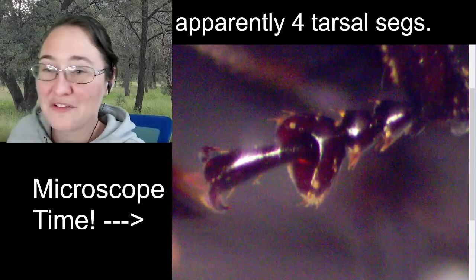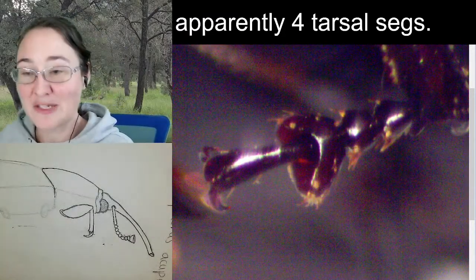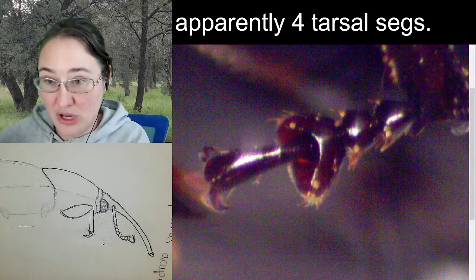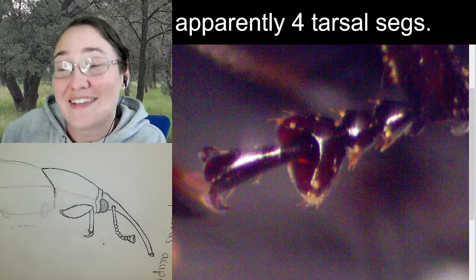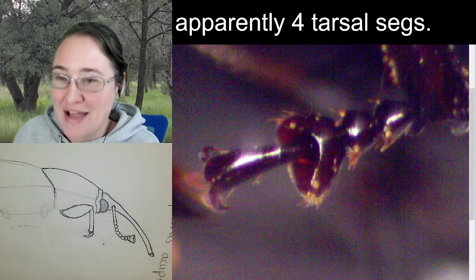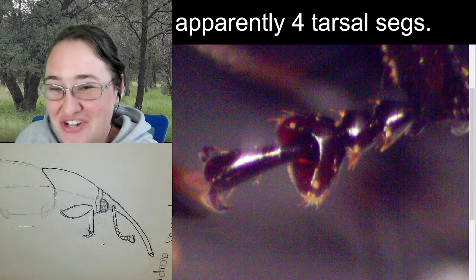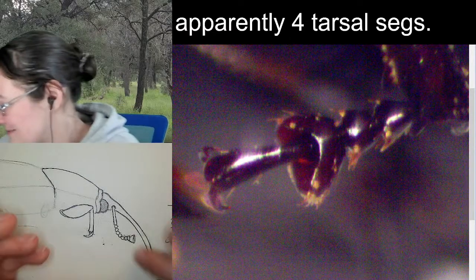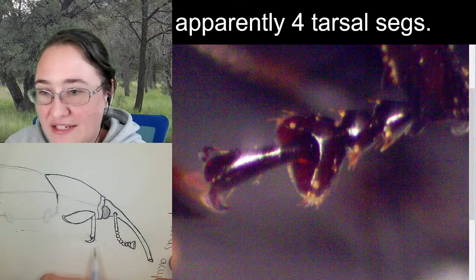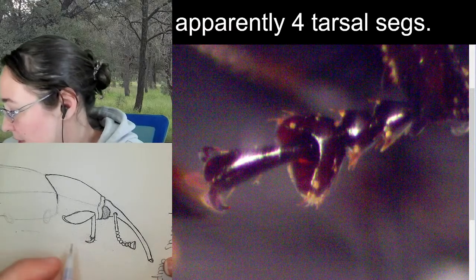But we call it apparently four tarsal segments because so many entomologists were getting it wrong over and over that we had to just rewrite the keys in a way that people would know that there might be an extra tarsal segment kind of hidden in there. It's kind of funny. And I believe all of the legs on this weevil are going to have that.